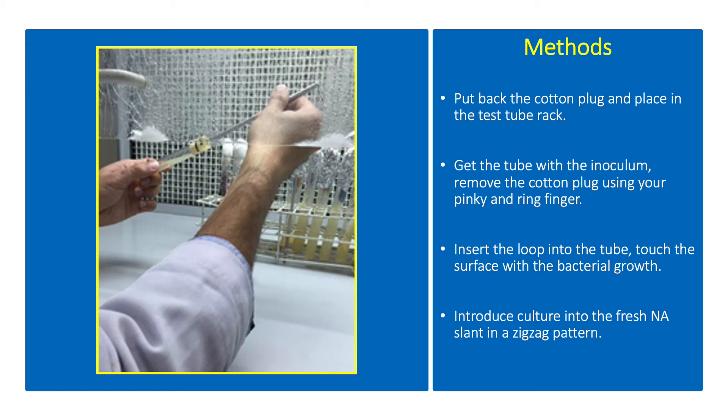Remove the cotton plug using your pinky and ring finger. Insert the loop into the tube and touch the surface with the bacterial growth. Inoculate the culture into a fresh NA slant in a zigzag pattern. Flame sterilize the loop after use.